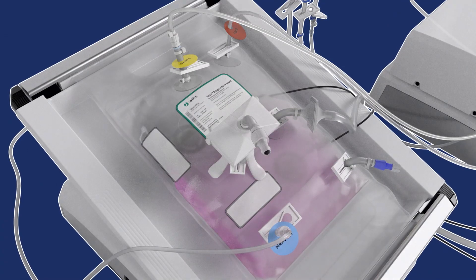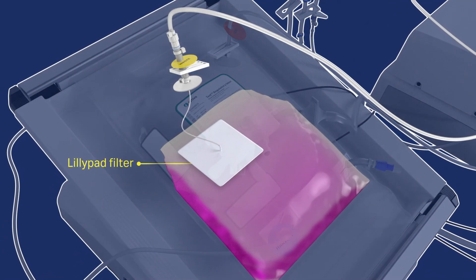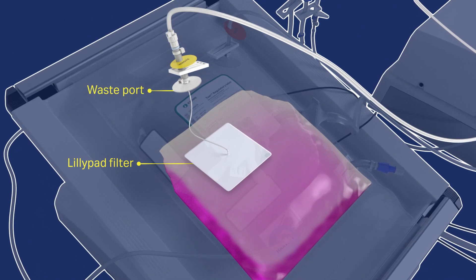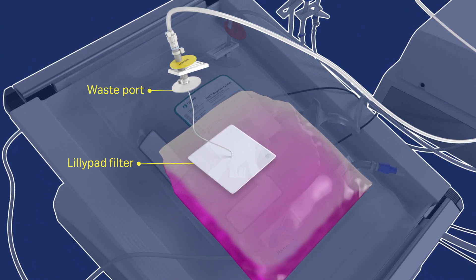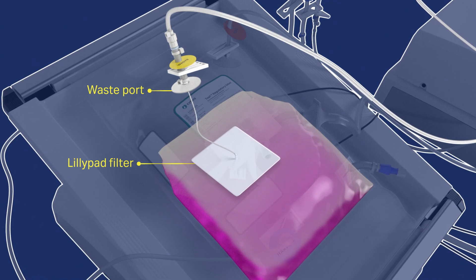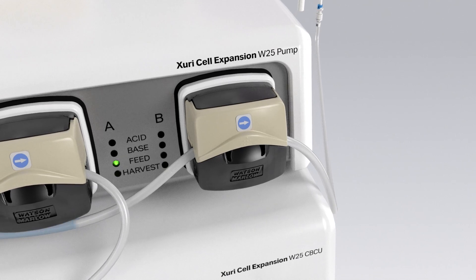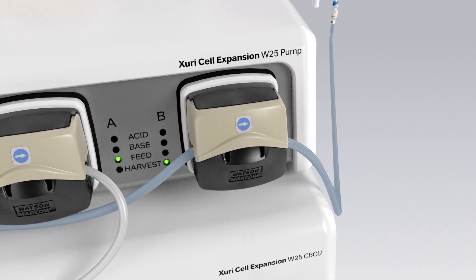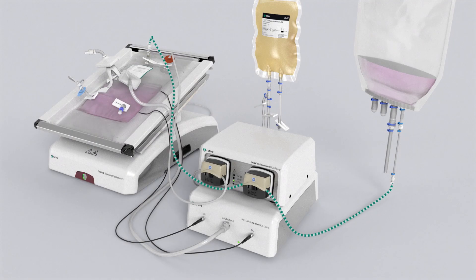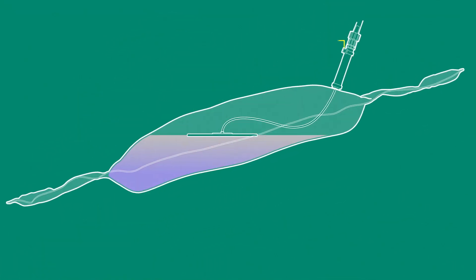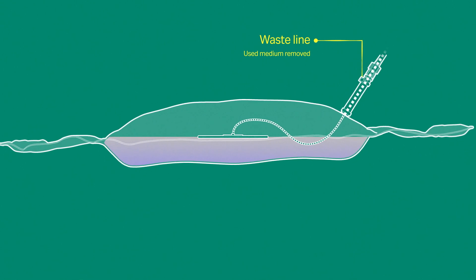To provide a perfusion solution, a filter connects to the wall of the bioreactor with a waste tube. The outside port of the waste tube ends in a luer connector that fits the pre-attached silicon tubing and waste vessel. Operating the peristaltic pump creates suction that draws liquid through the filter into the waste vessel. The filter retains cells due to the movement across the culture surface.